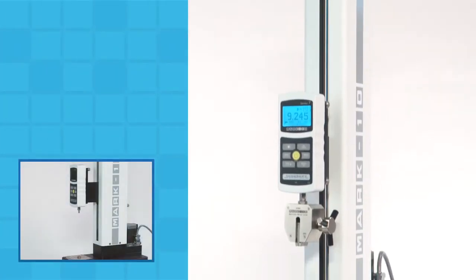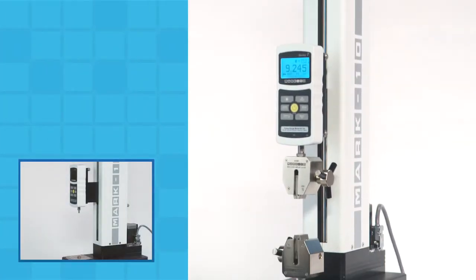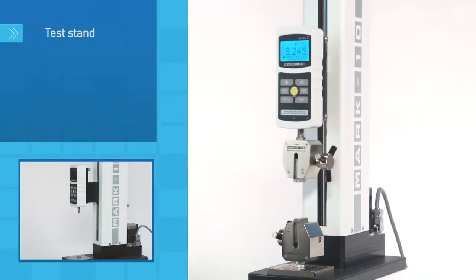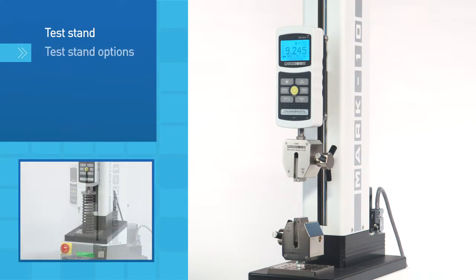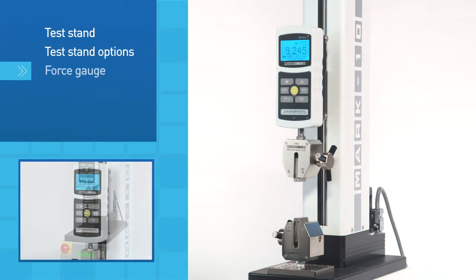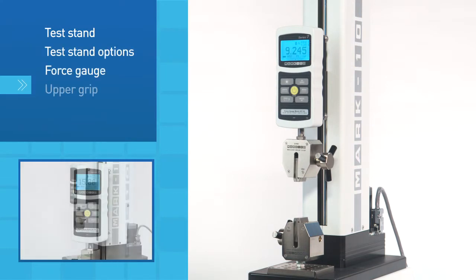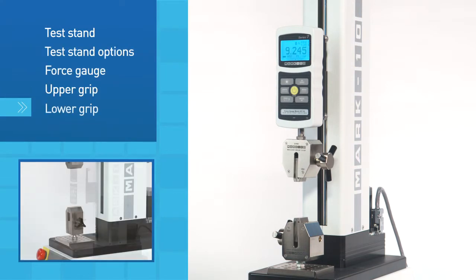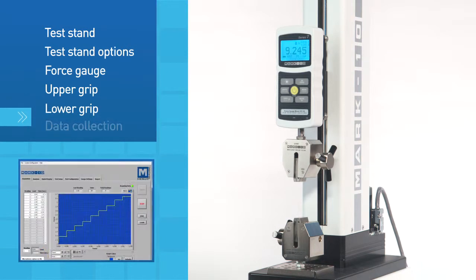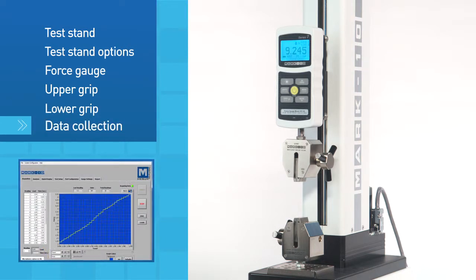Customize a system to meet your needs with a choice of test stand, test stand options, force gauge, upper grip, lower grip, and data collection software.